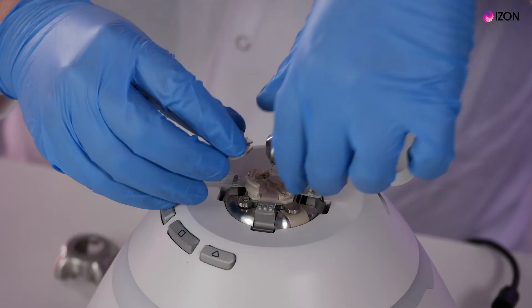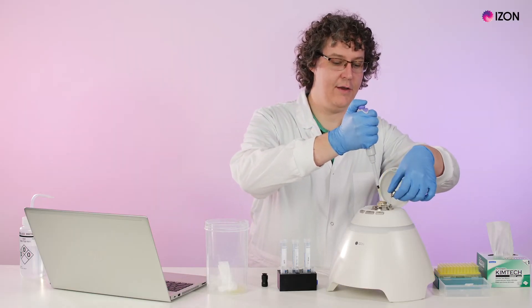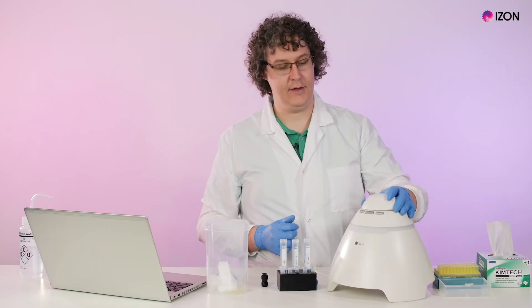Attach the upper fluid cell and add 35 microliters of measurement electrolyte. Attach the shielding cap, insert the pressure nozzle, and close the lid.